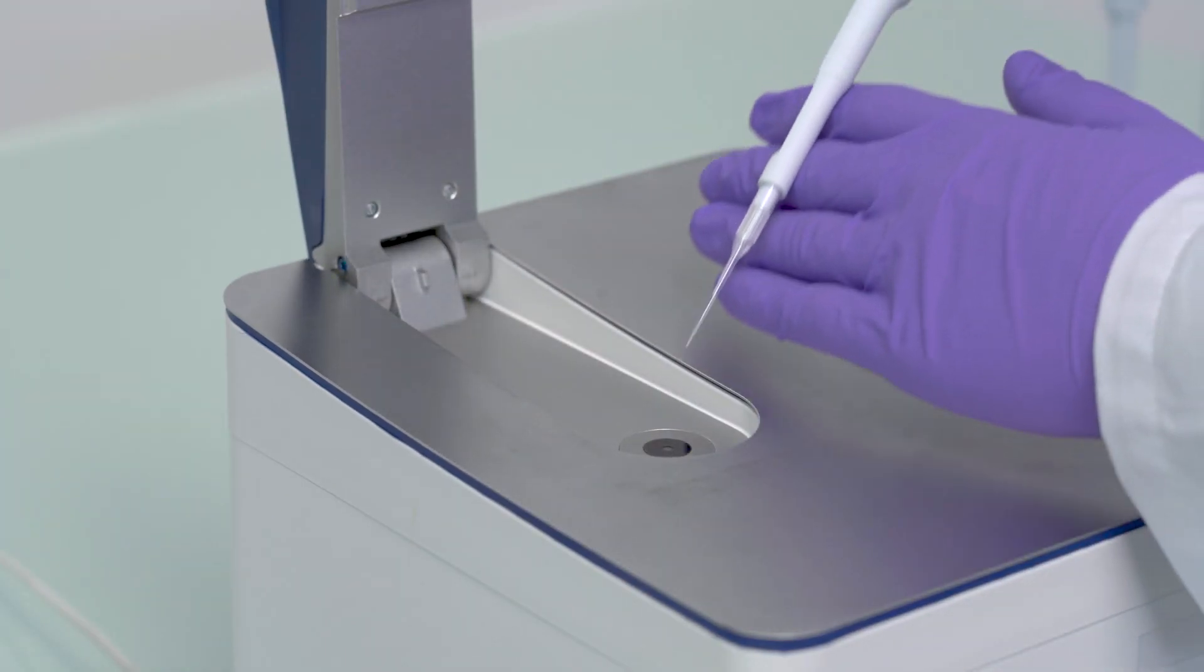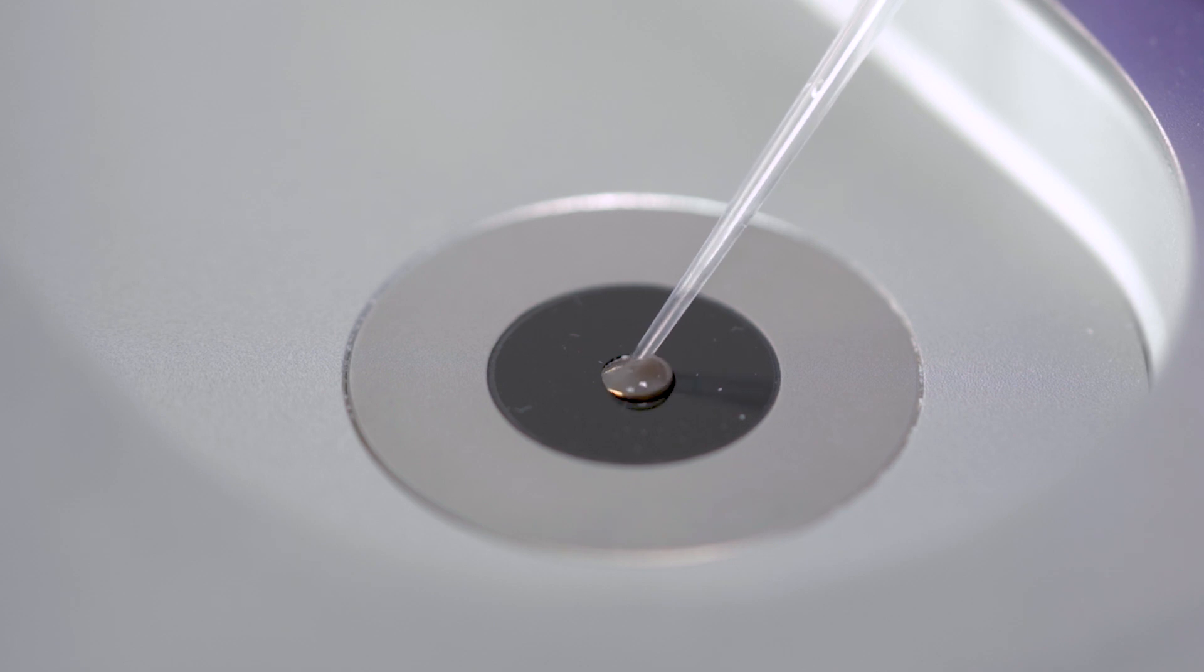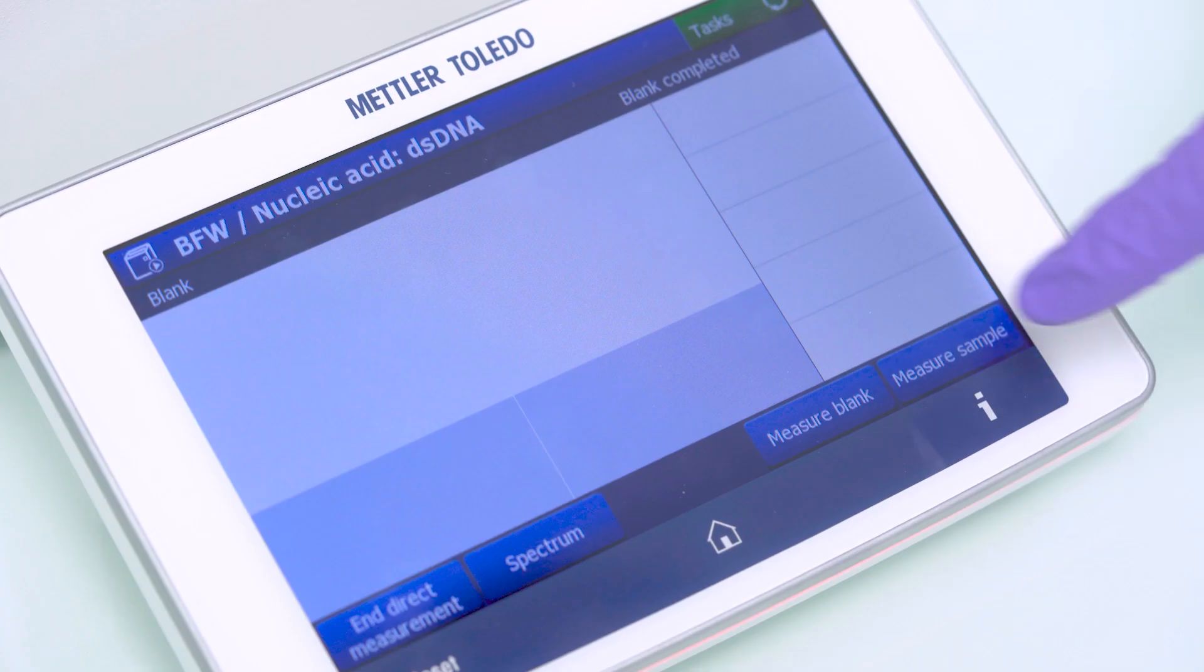Right now I will show you how easily such a purity measurement can be done. We pipette one droplet of our DNA sample onto the microvolume platform of the spectrophotometer, press start, and obtain the concentration and purity results directly on the display.